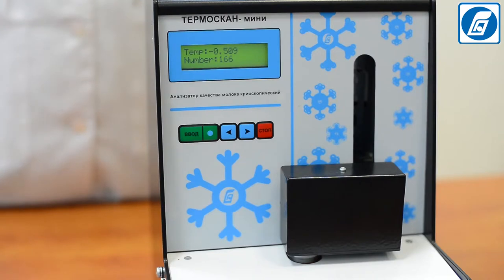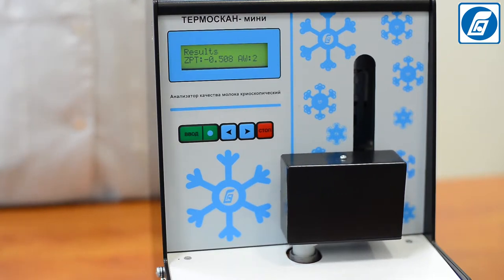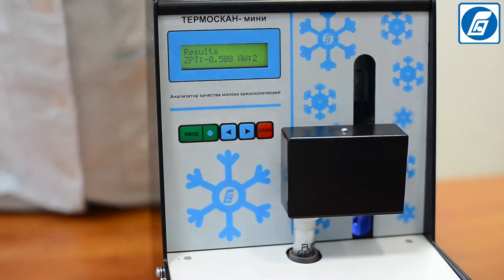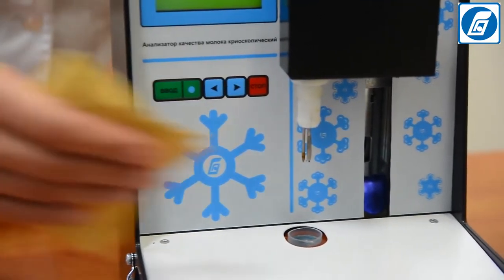Freezing is stimulated by a stirring wire that strikes against the test tube walls. After crystallization begins, the sample temperature quickly rises and for some time remains practically constant before its fall. The freezing point is the highest temperature reached in that period, and this value is automatically fixed and displayed on the analyzer's indicator. Wipe the probe and stirring wire with a soft, clean, non-fibrous tissue.